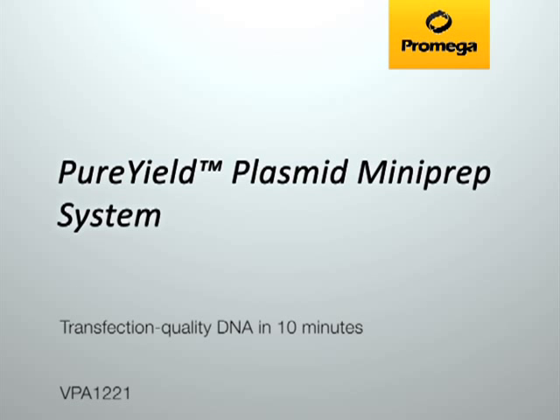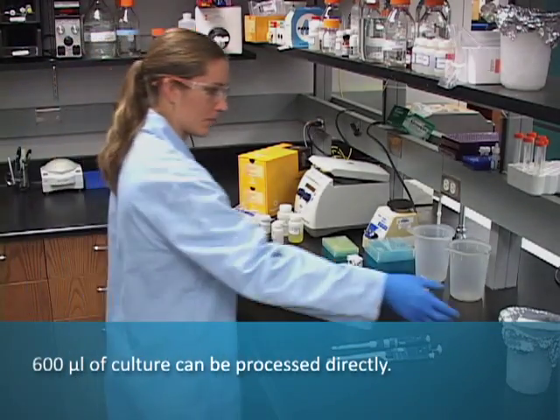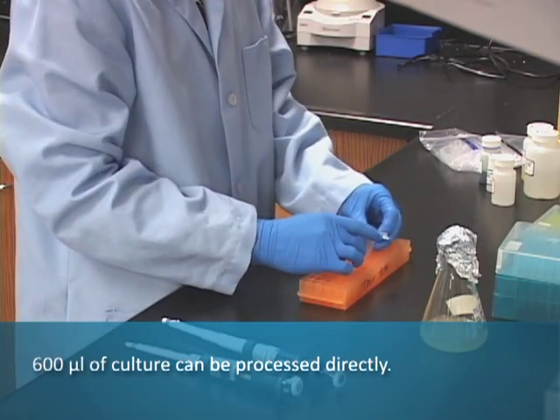You are listening to a podcast protocol for the Pure Yield Plasmid Mini-Prep System. Using the Pure Yield Plasmid Mini-Prep System, you can directly process 600 microliters of bacterial culture.